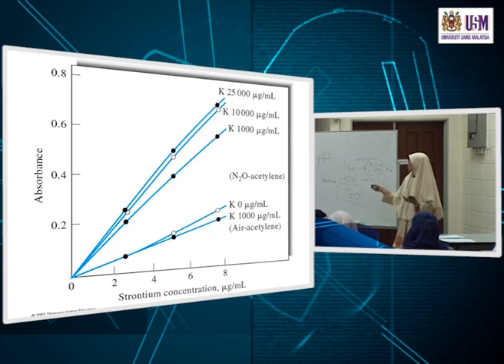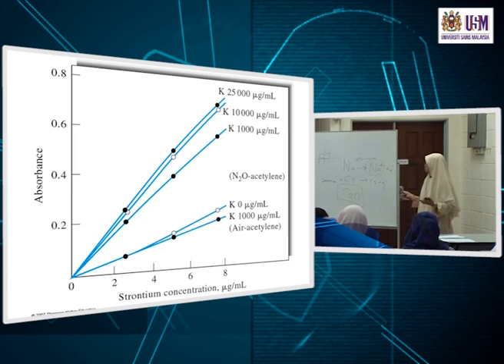Because you can look at emission also next time. Higher temperature, you expect emission to be higher, provided you have overcome it if ionization is a problem. Because why? Higher temperature, number of excited atoms, higher, right? From that Boltzmann distribution, N excited over N0 is dependent on temperature, e to the minus E over kT, okay? So higher temperature, ratio of excited to ground state, higher.